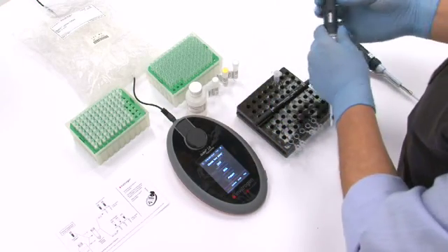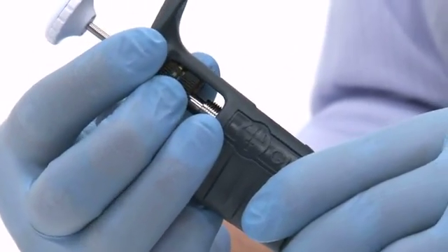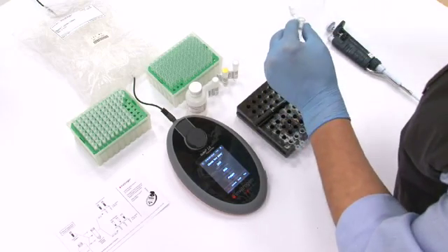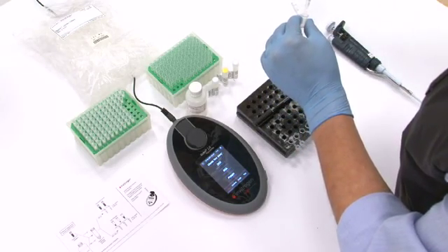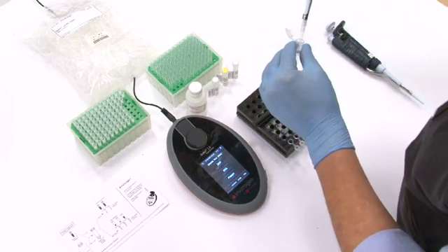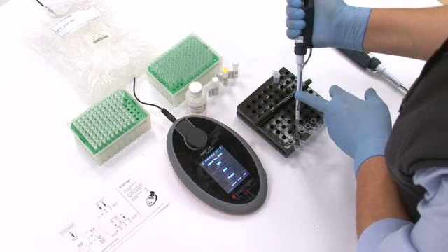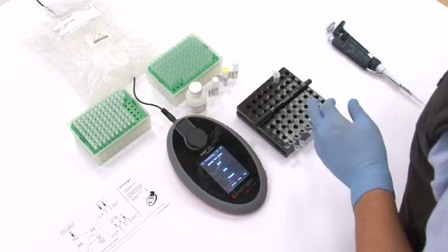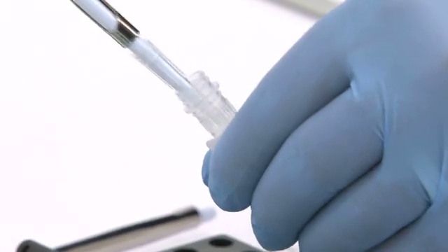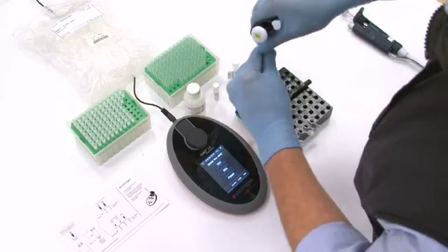Now we're ready to add the standards and the DNA sample. Use thin wall PCR tubes. For the DNA quantification assay, we need two standards. The total volume in each tube should be 200 microlitres. Add 190 microlitres of working solution, prepared previously, to each tube. Add 10 microlitres of standard 1 in the first tube and 10 microlitres of standard 2 in the second tube.